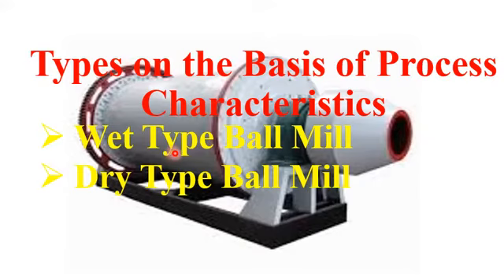So in a wet type ball mill apparatus, water is added at the same time as feeding, and the material is discharged as a slurry of a certain concentration.